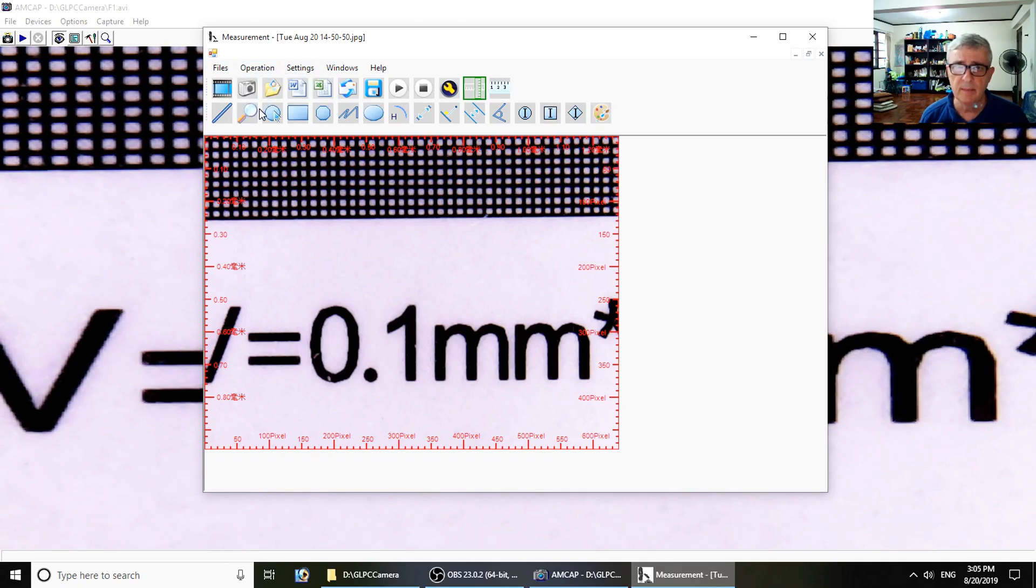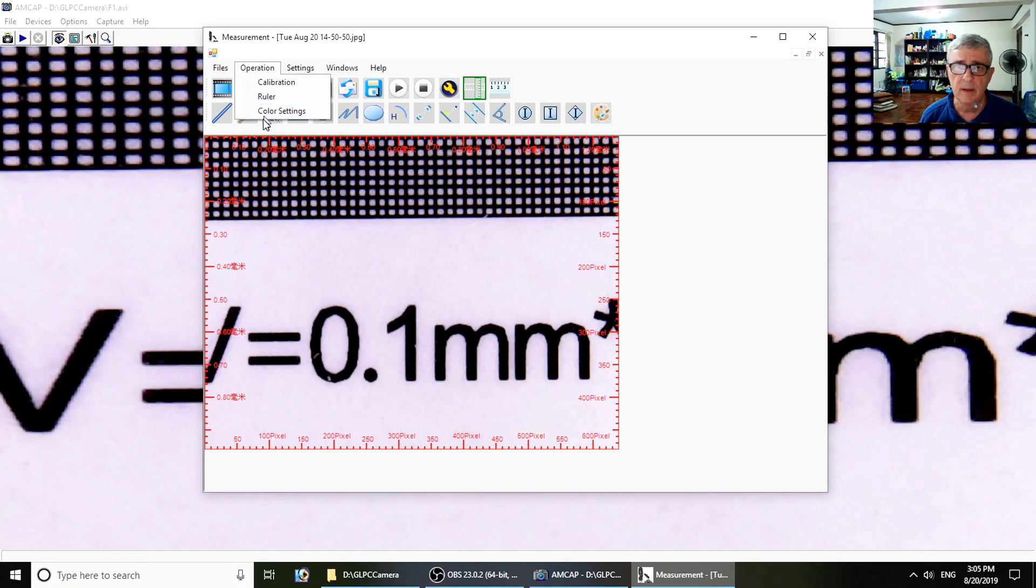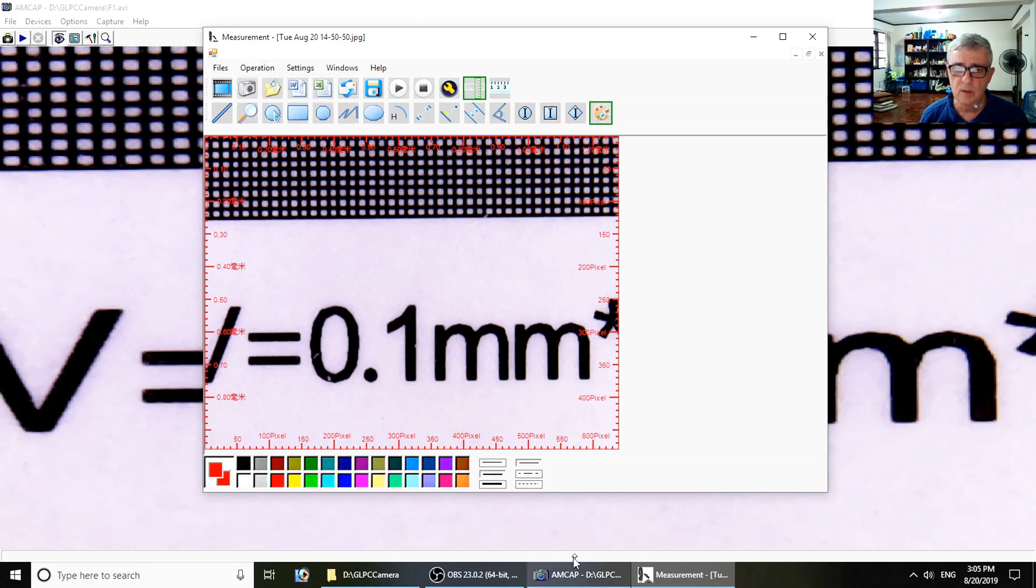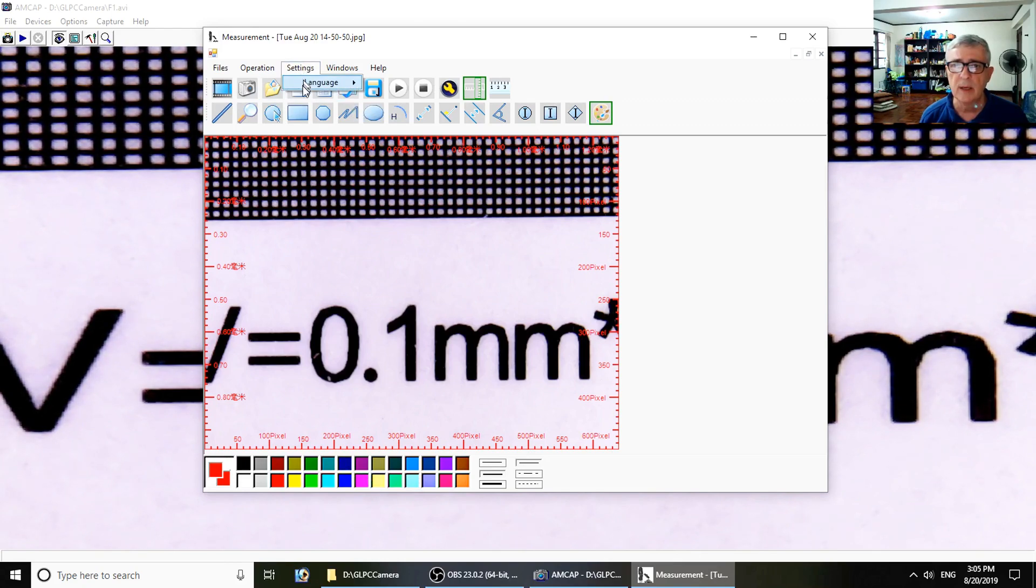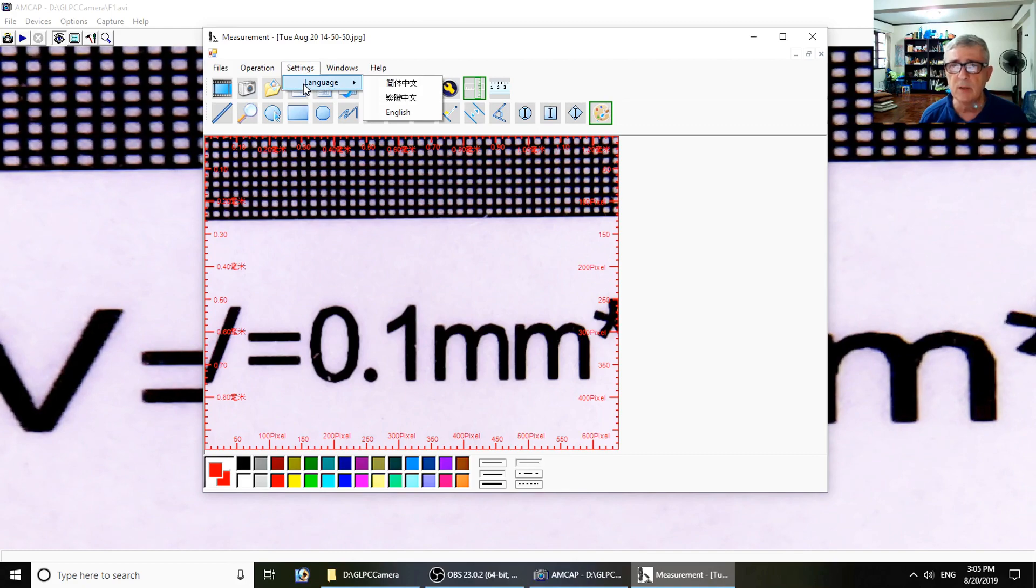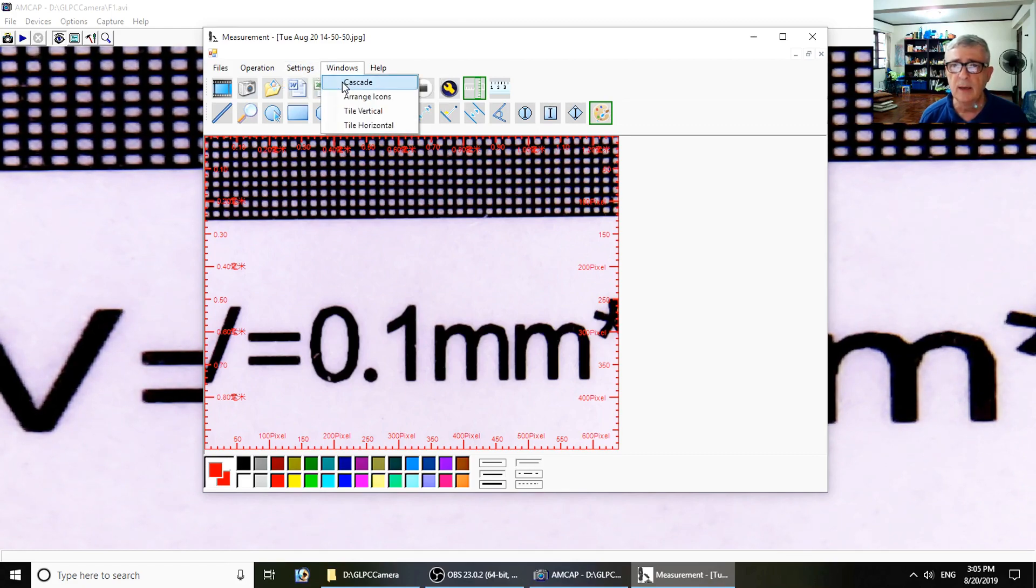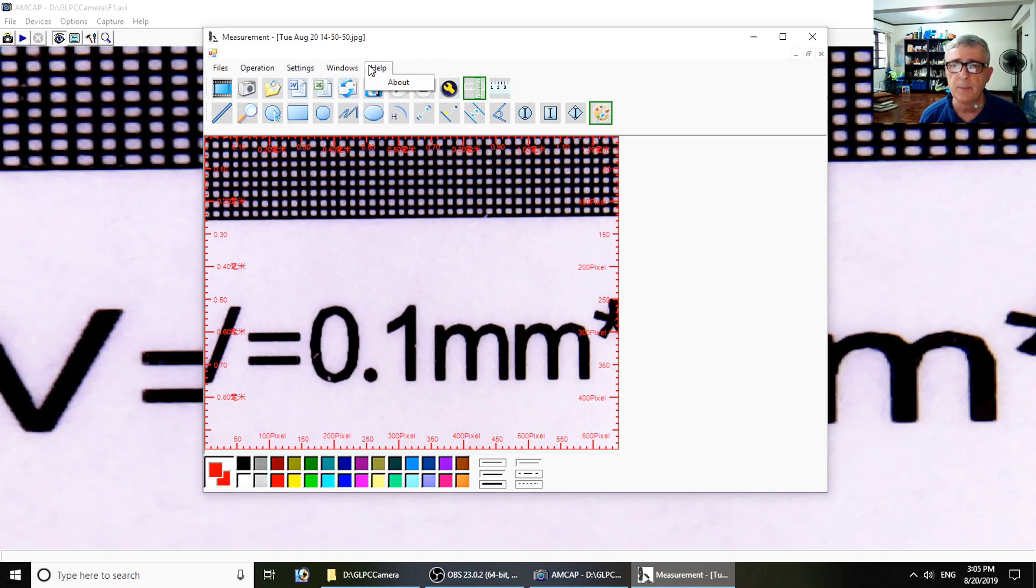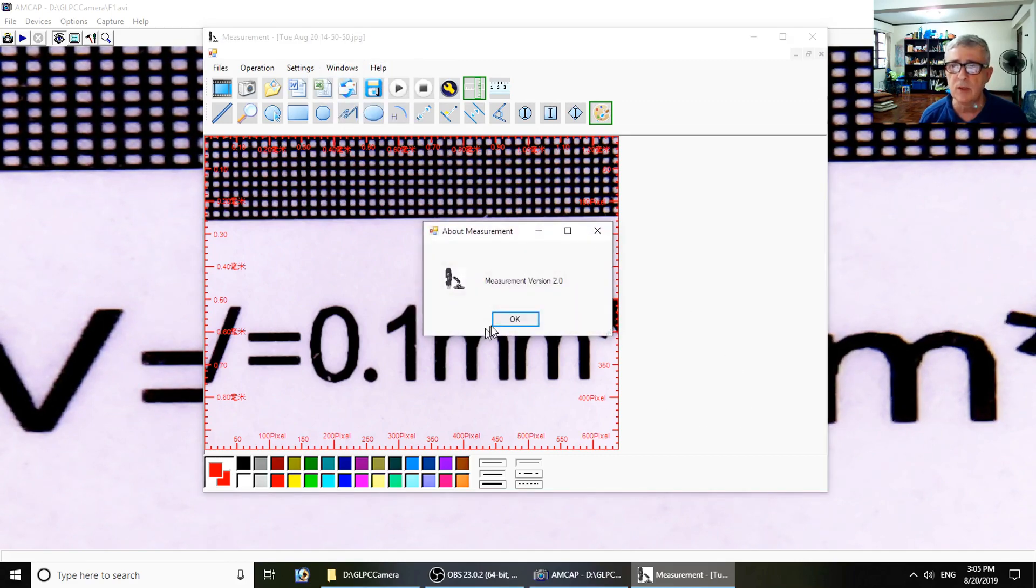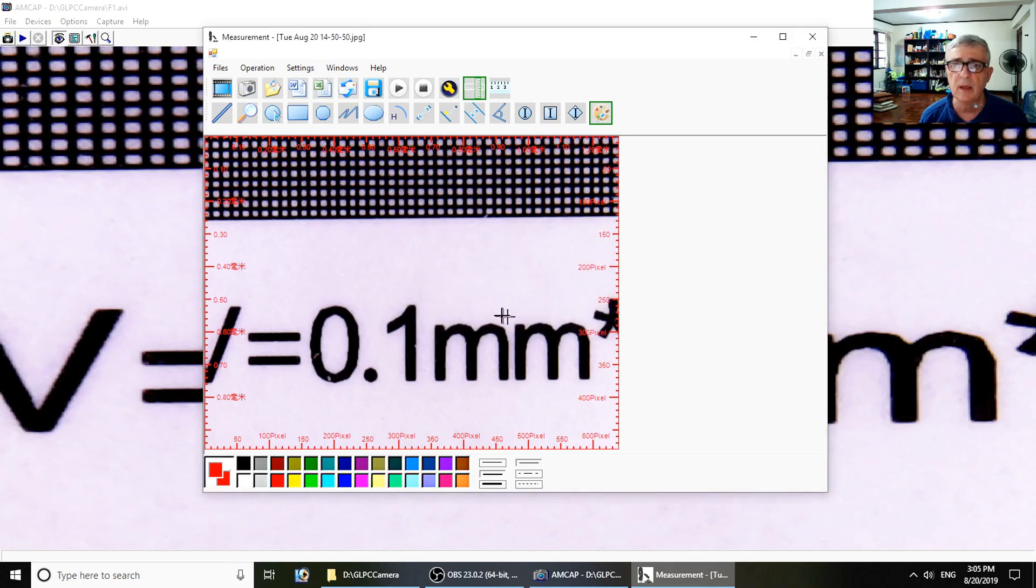Color settings are the color swatches down here - it makes them appear. Export to Outlook. Language - my choice of two Chinese or one English. Windows - I can cascade them. This works a lot like Microsoft Paint. And then help is just the version, not much help to it.